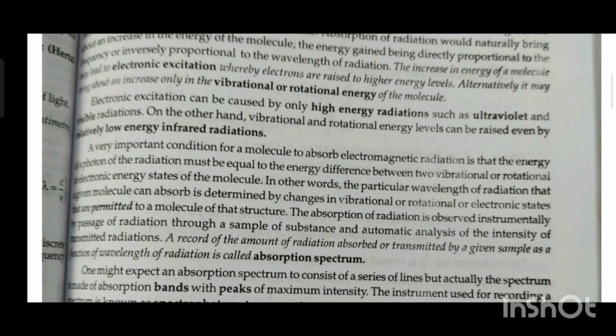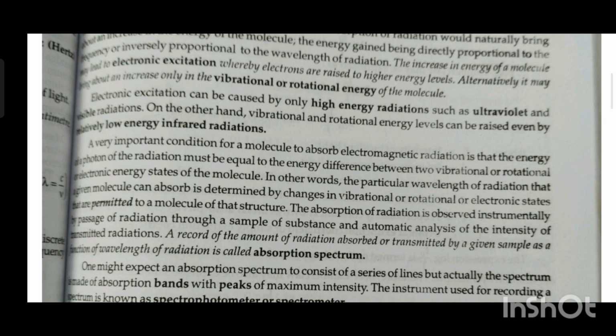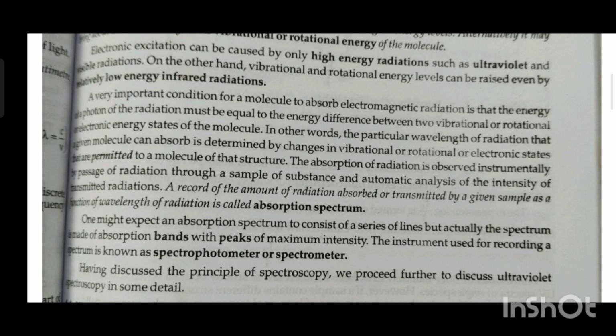The absorption of radiation is observed instrumentally by passing radiation through a sample of a substance and automatically analyzing the intensity of the transmitted radiation. A record of the amount of radiation absorbed or transmitted by a given sample as a function of the wavelength of the radiation is called an absorption spectrum.